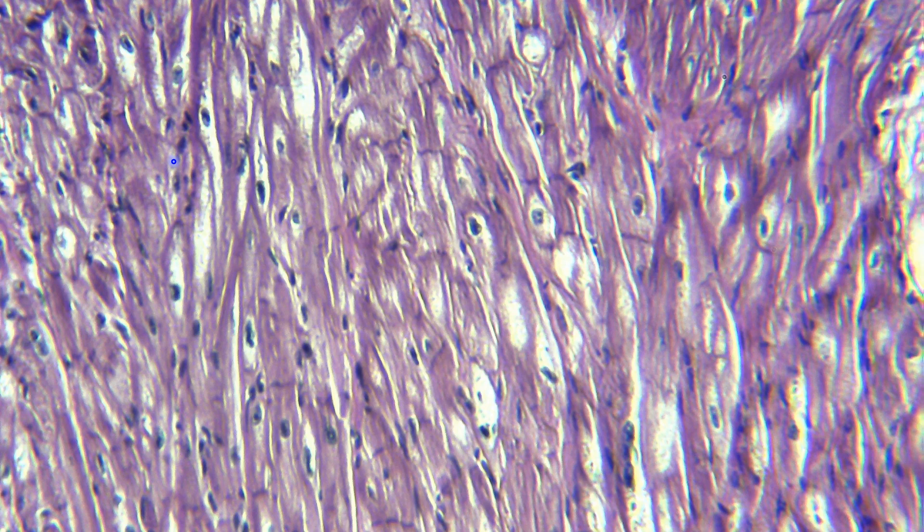So I think we should look a little closer and then farther away, and I think you'll be less confused. Looking at it closely, we can see these light and dark stripes — those are the striations. You can also see these darker stripes going in the same direction; those are the intercalated discs. If you look around, there are a ton of intercalated discs.